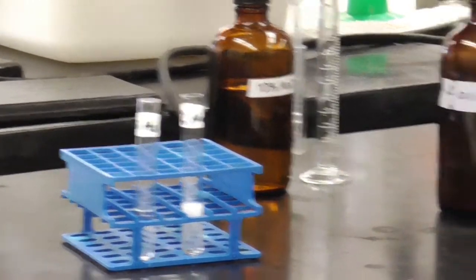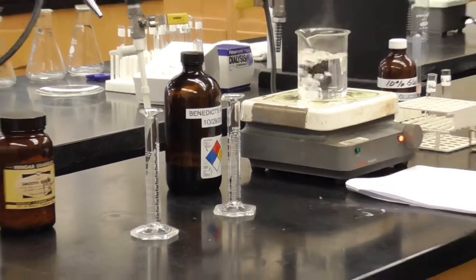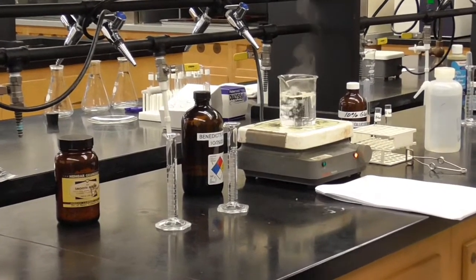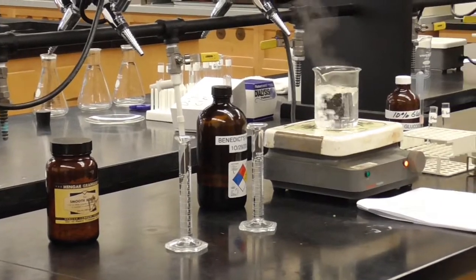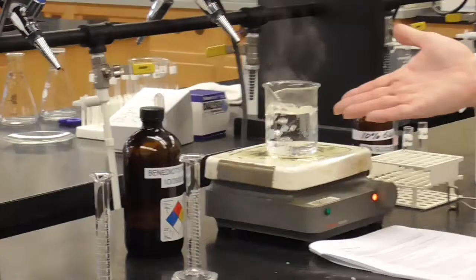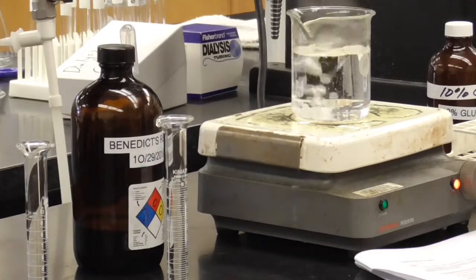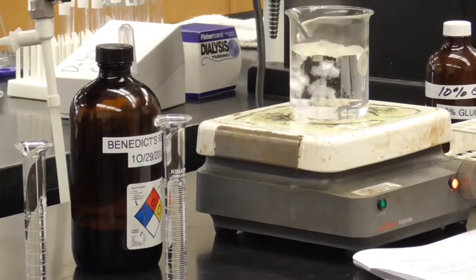Moving right along, here's our second station. This one is for glucose. So again, for blood sugar, how do we test for blood sugar? We use something called Benedict's reagent. And again, we'll do the positive and the negative to see what both of those look like. First, prepare a boiling water bath. There we go. Got that going already. We've got some boiling chips in there just to smooth the boiling out a little bit. It's just water in there and it's boiling away on our hot plate.